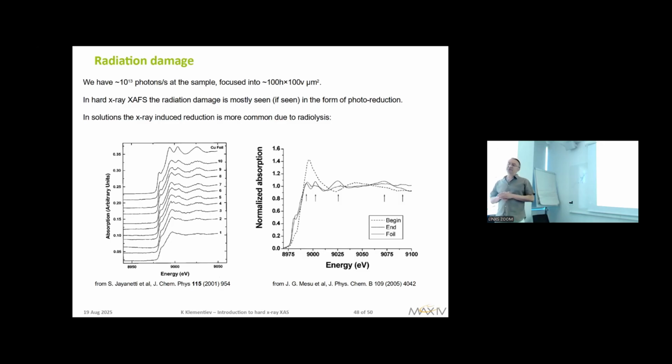Water is split by X-rays with what's called radiolysis. And what is then formed is hydrogen as bubbles, you see, especially from liquids, and hydroxyls. Hydroxyl is extremely aggressive. It changes chemical state of your sample. And so this is what is radiation damage.